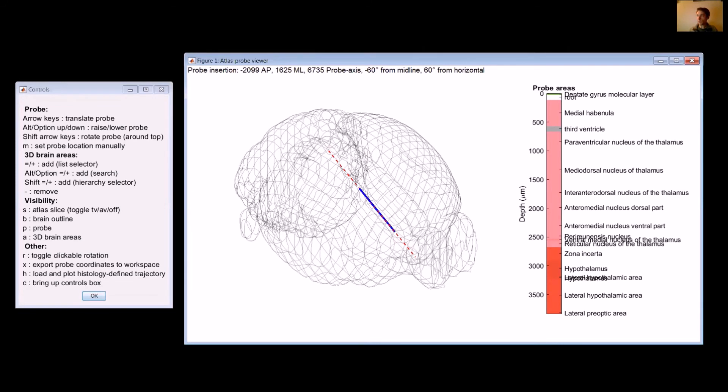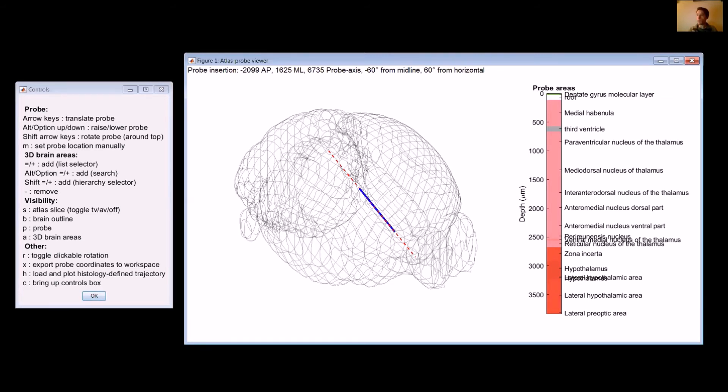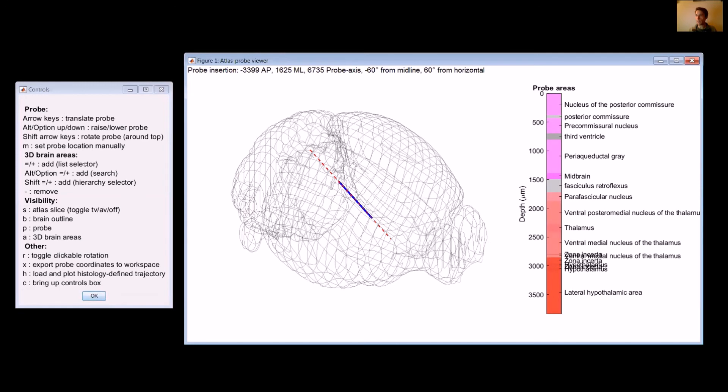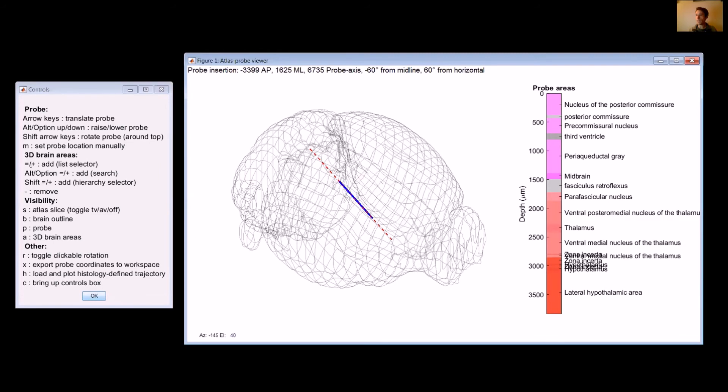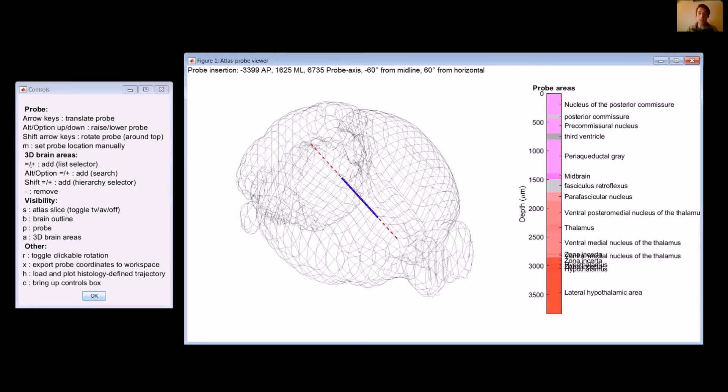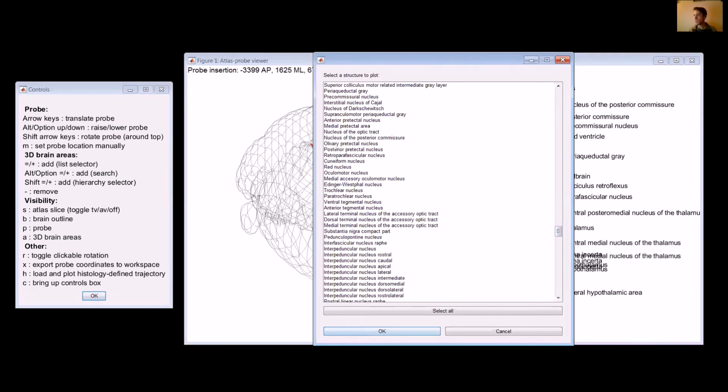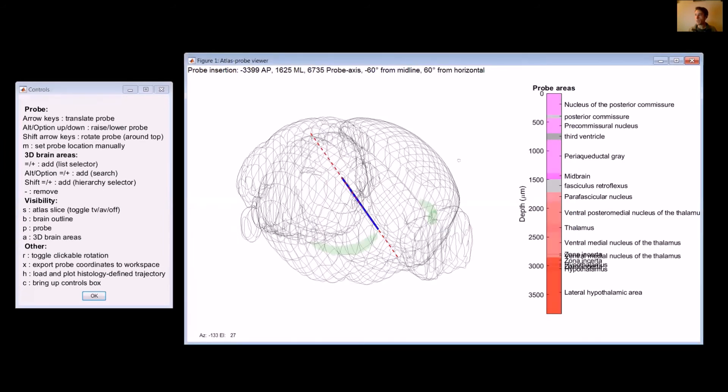Probably the most important feature that you'll use is this 3D brain areas thing. In this case, let's say I have an area that I want to hit and I want to plot it in 3D and then I want to move my probe around so that I can have it go through that area. There are three ways to pick an area based on your favorite kind of hierarchy. First of all, you just hit the plus key. And I should mention that I guess if you don't have a num pad, this is also the equals key. So I'll hit plus here. It'll bring up all of the areas that the Allen Atlas has parsed so you can pick one of them. Let's pick the clostrum. And then it'll draw this in 3D space. So that's one way to do it, is hit plus and it brings up everything.